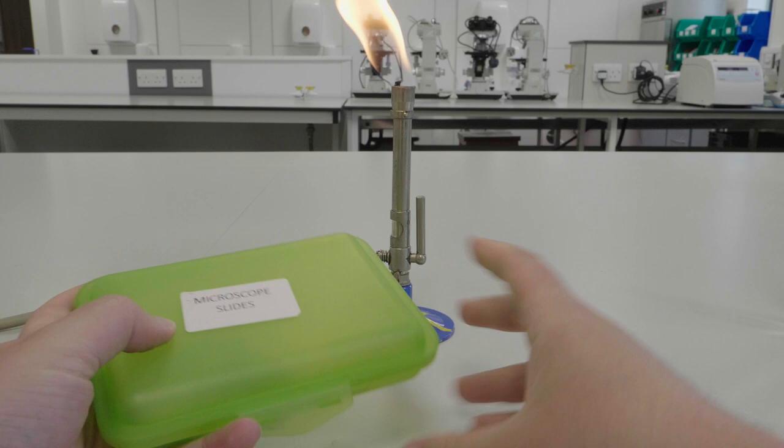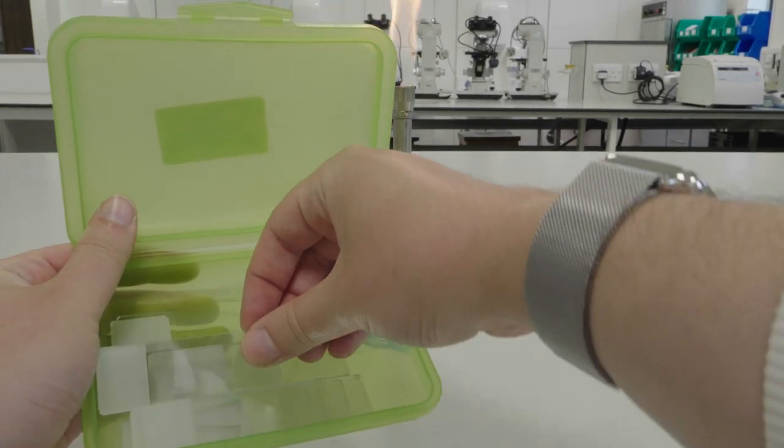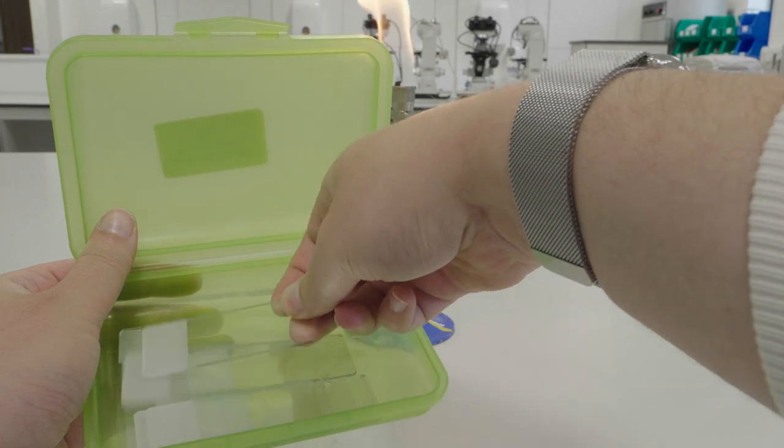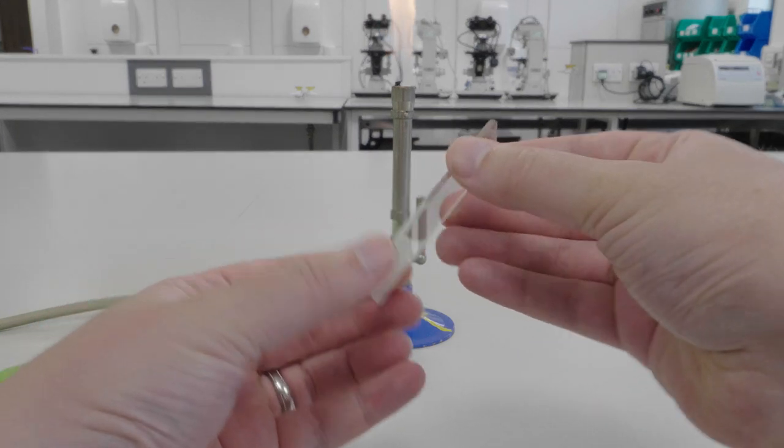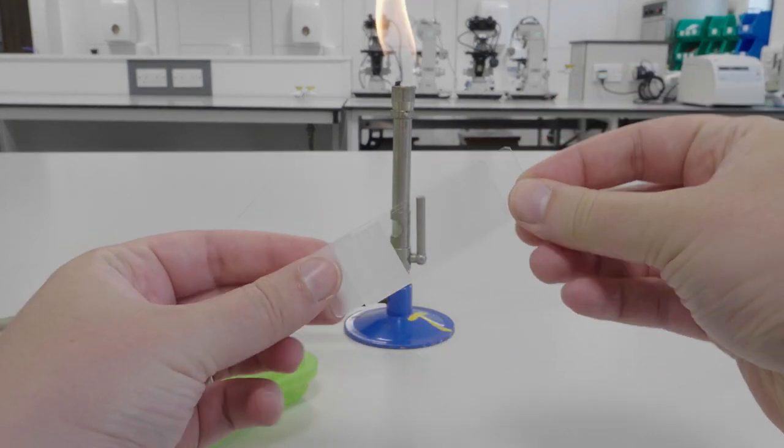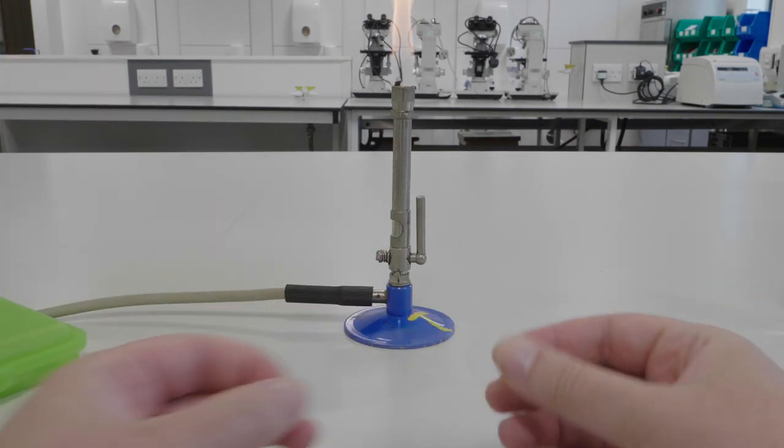Before we make a film we need to remove any grease from the microscope slide. Remove a slide from the box and make sure you have a single slide. You will note in the video that I had two slides stuck together, this is very common so please make sure you check you have just one.